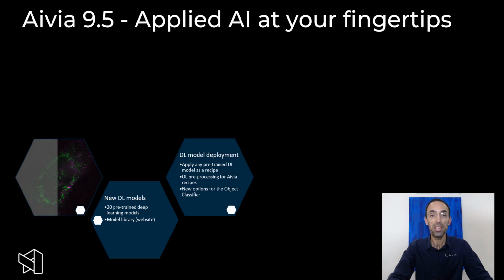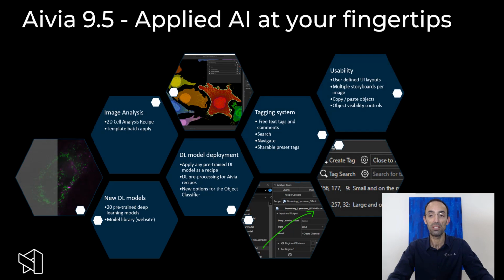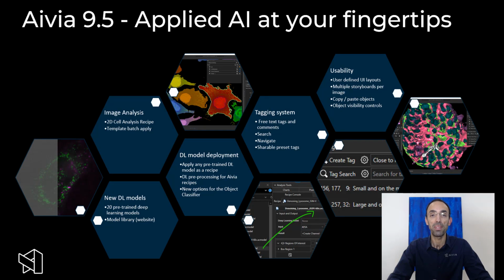There's also a library that is online and you can use it now. I'll share the link in a moment. We have developed a couple of ways for you to deploy these models. So we will share that with you today and discuss those. Actually, there's 4 ways and I'll show those in a moment.